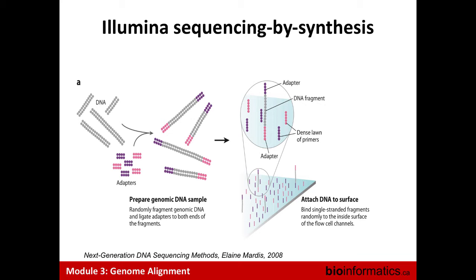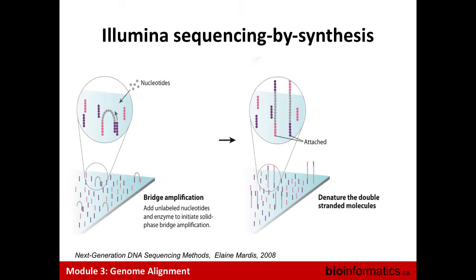This is where the magic of the technology is, when we do what we call bridge amplification. You will have your strand of DNA, but there will still be some free probes on the flow cell. So your strand will match another probe which has the complementary of the second end, and that will create a bridge between the two probes. Then you will do PCR amplification of your fragments, and you will have another copy of your data in close proximity on your flow cell.